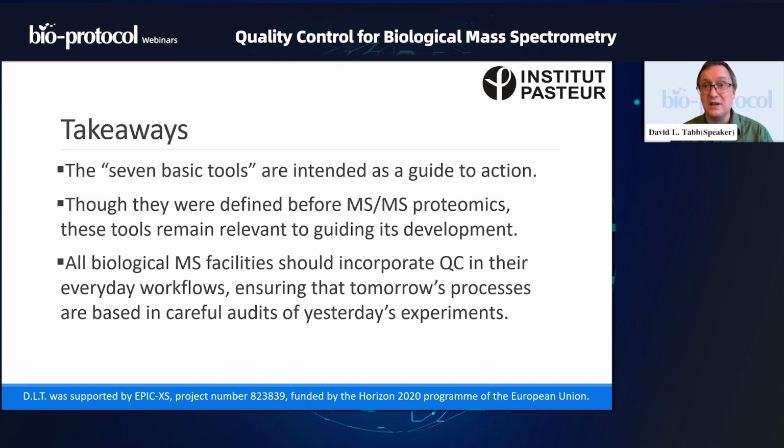to create check sheets. Very frequently, when a graduate student joins a laboratory for the first time, they are told to ask all their questions to the postdoc. And the postdoc is there for 2 months and then they're gone. And someday the grad student has a question that they cannot ask the person who's no longer there. We need to capture this quality control information, the standard operating procedures and so on in an institutional wisdom kind of way, in a way that we're able to all refer to it and all agree on how we shall conduct our experiments.